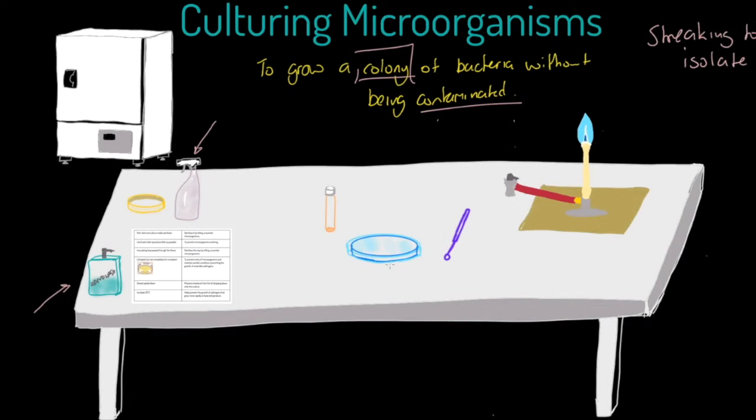Just to repeat: the lid is on the petri dish — open it as little as possible. Once we've streaked the plate, we are going to tape the lid closed and make sure the lid is labeled. Once it goes into the incubator, we are going to flip the petri dish upside down.